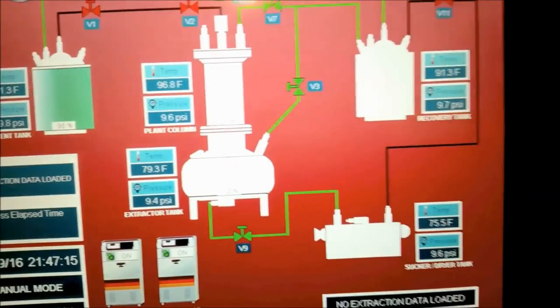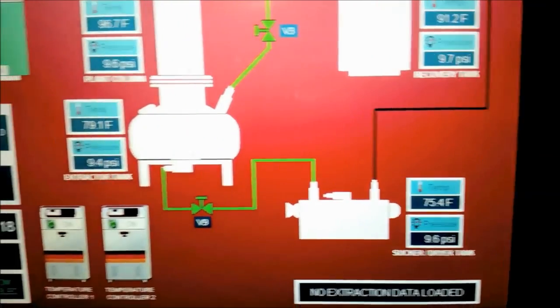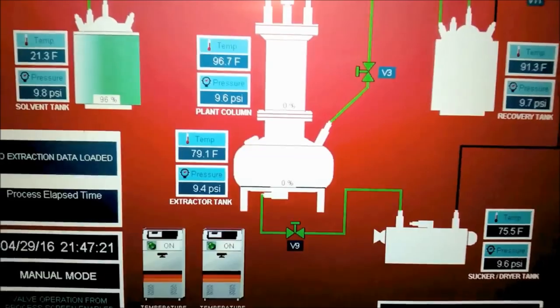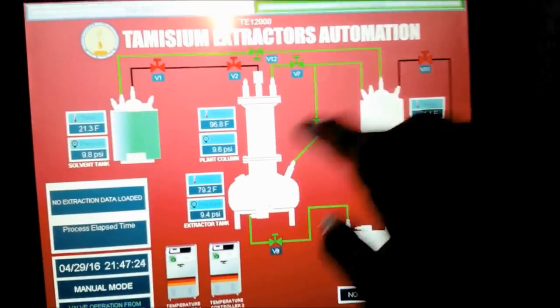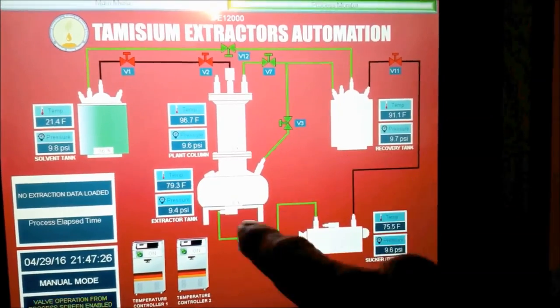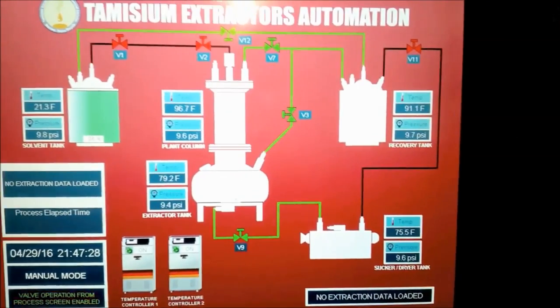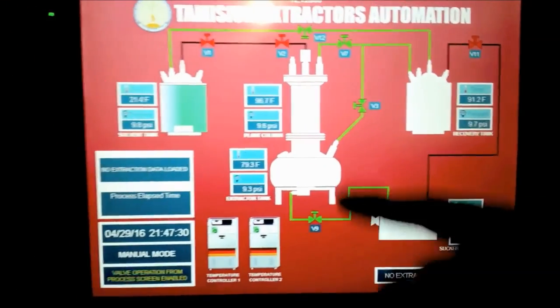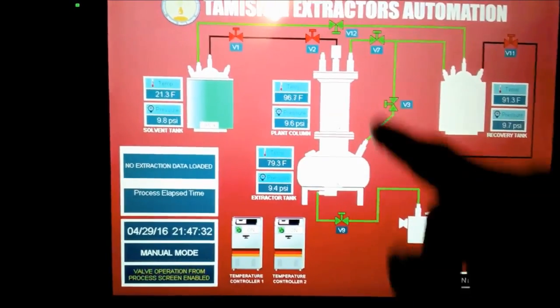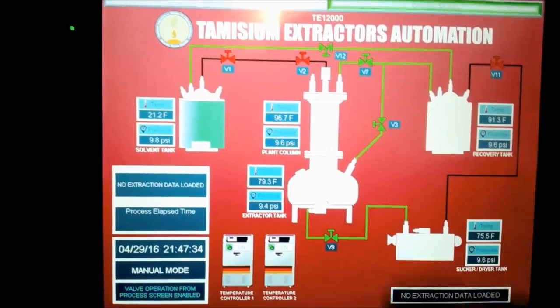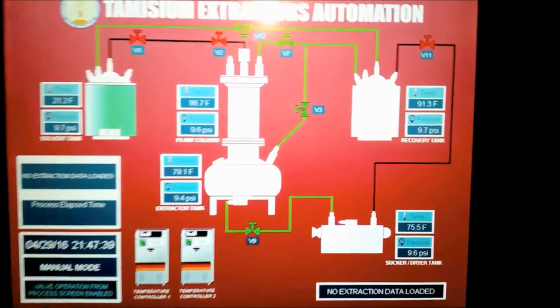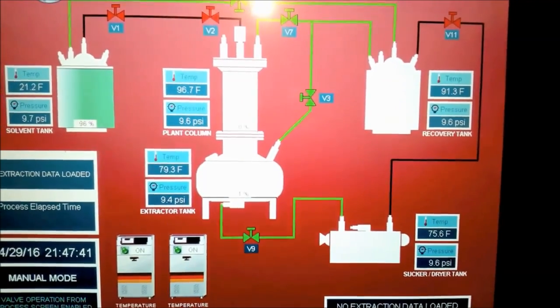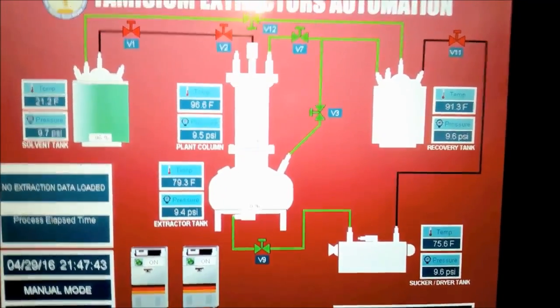Pressure on the tanks will start at 28 psi and it's dropping. Takes about an hour to recover all the vapor pressure. There's vapor in each one of these tanks that's pressure locked. You only open this tank, the column, to replace more plant material inside, and you only open this tank to access your extract out. So those are the only two tanks that you open up during the process.